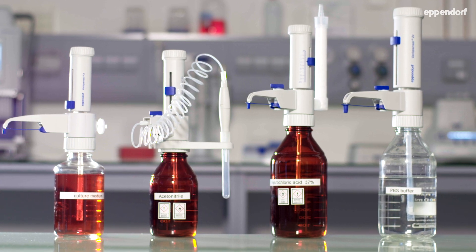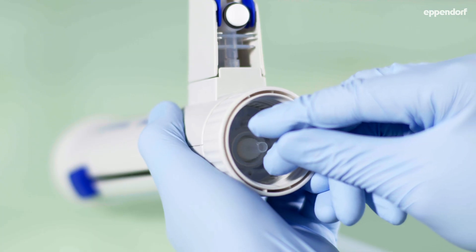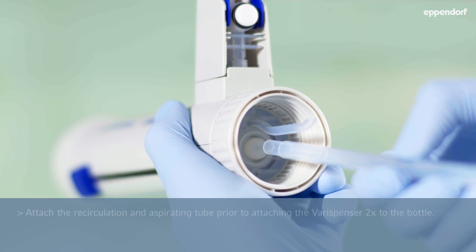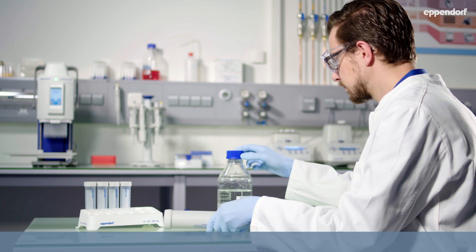Dispensing chemicals is a daily routine in almost every lab. Some chemicals require special handling. The Verispenser 2 and 2X offer a solution for almost all chemicals used in daily lab routine.